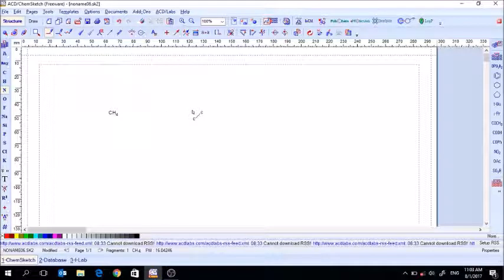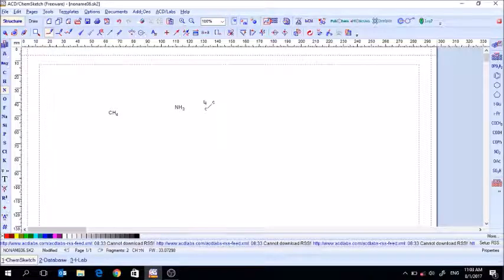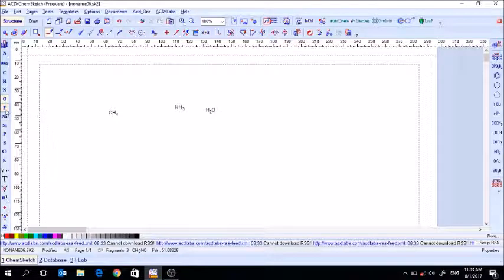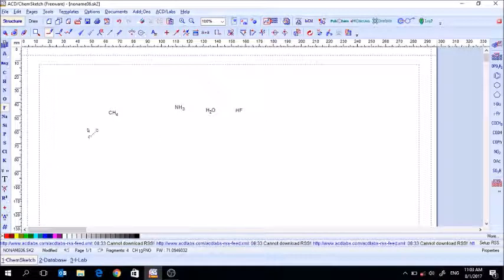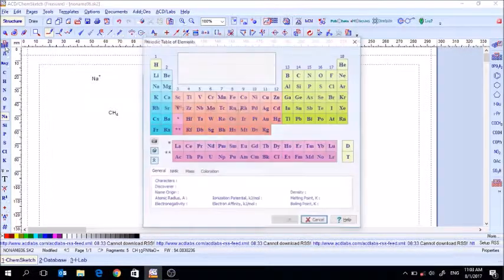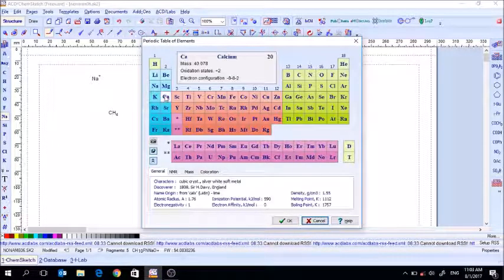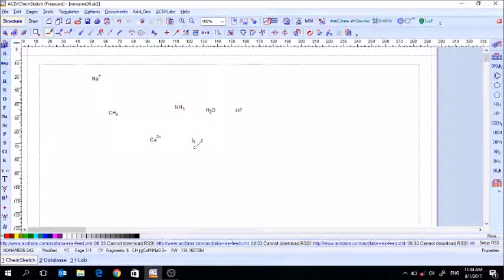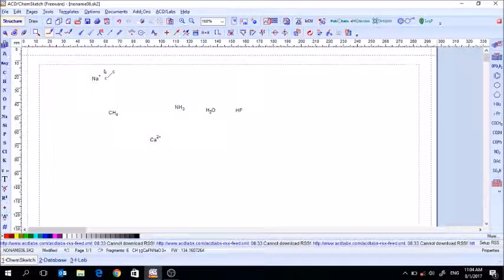Nitrogen normally forms three covalent bonds, so when you add a nitrogen you get three hydrogens. Oxygen gets two, and halogens like fluorine get one — it automatically fills those out. Now if you add a metal rather than a non-metal, instead of adding hydrogens it just shows a normal charge. For example, calcium shows a two-plus charge, so metals and non-metals are treated differently.